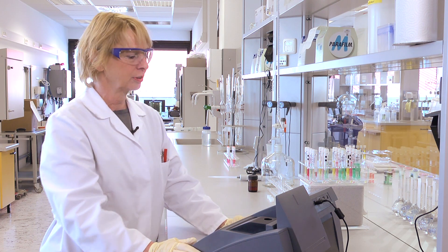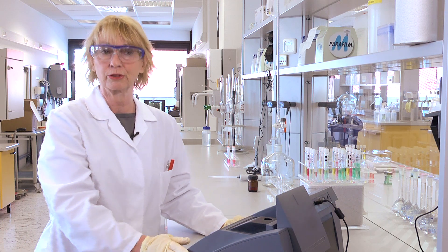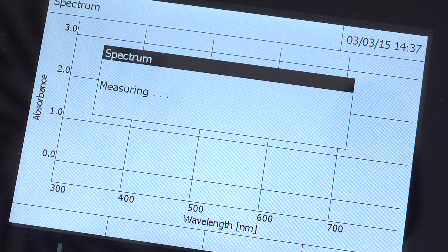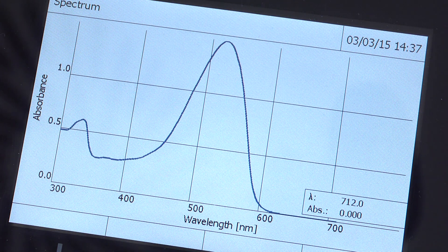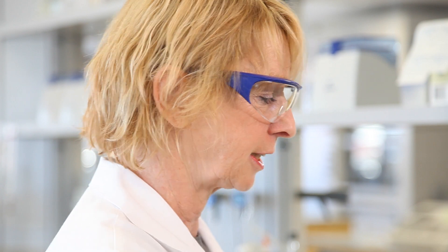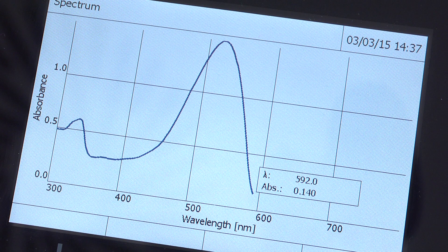Absorbance and transmission readings can be used for qualitative analysis in production monitoring, for example. But how do we get from qualitative analysis to quantitative analysis? First, we need to run a spectrum — testing the substance along the whole wavelength range — and we see a peak in this spectrum at 525 nanometers.